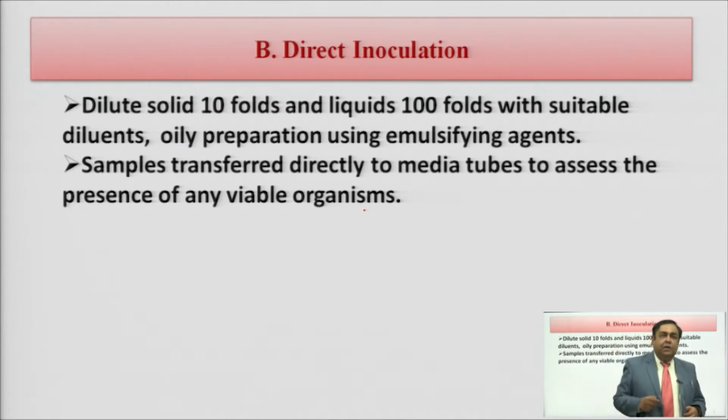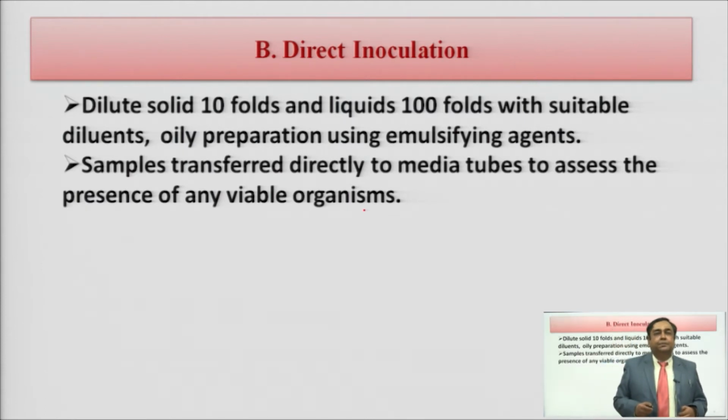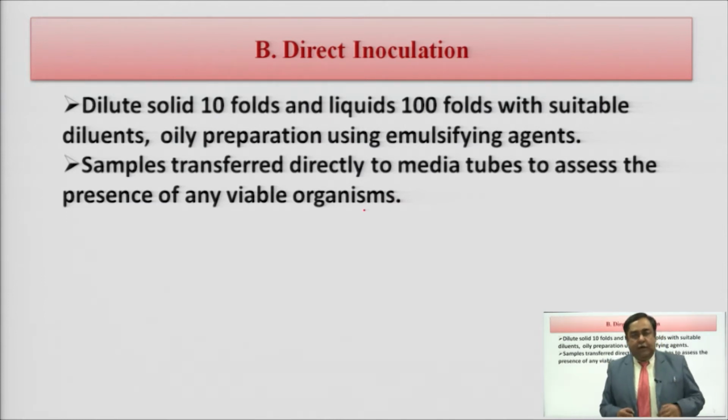Now, this is commonly used for solids, where you have to dilute it tenfold. In case of liquid, if the volume is small, you need to dilute it 100 times with the help of any diluent.